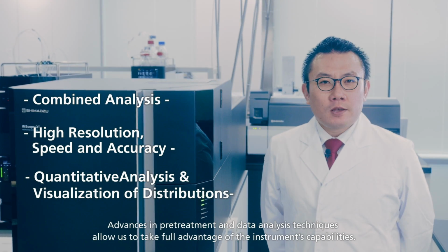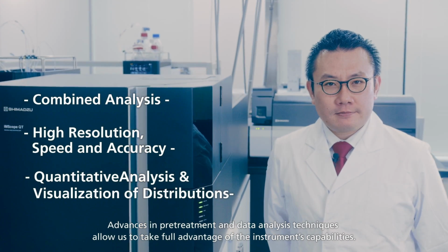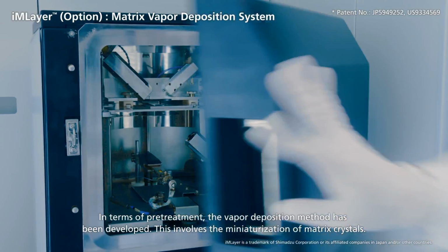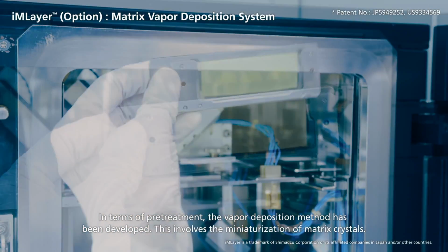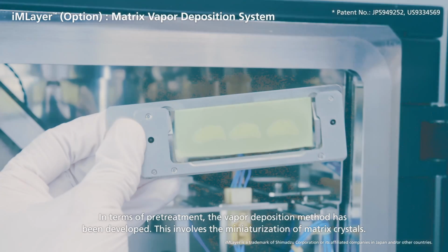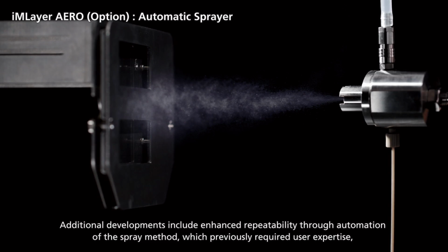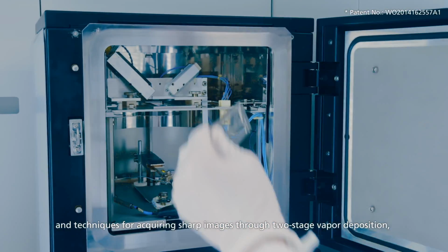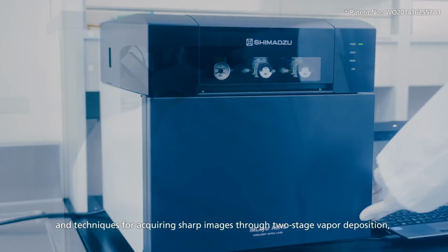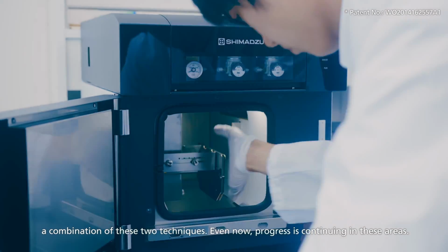Advances in pre-treatment and data analysis techniques allow us to take full advantage of the instrument's capabilities. In terms of pre-treatment, the vapor deposition method has been developed. This involves the miniaturization of matrix crystals. Additional developments include enhanced repeatability through automation of the spray method, which previously required user expertise, and techniques for acquiring sharp images through the two-stage vapor deposition, a combination of these two techniques. Even now, progress is continuing in these areas.